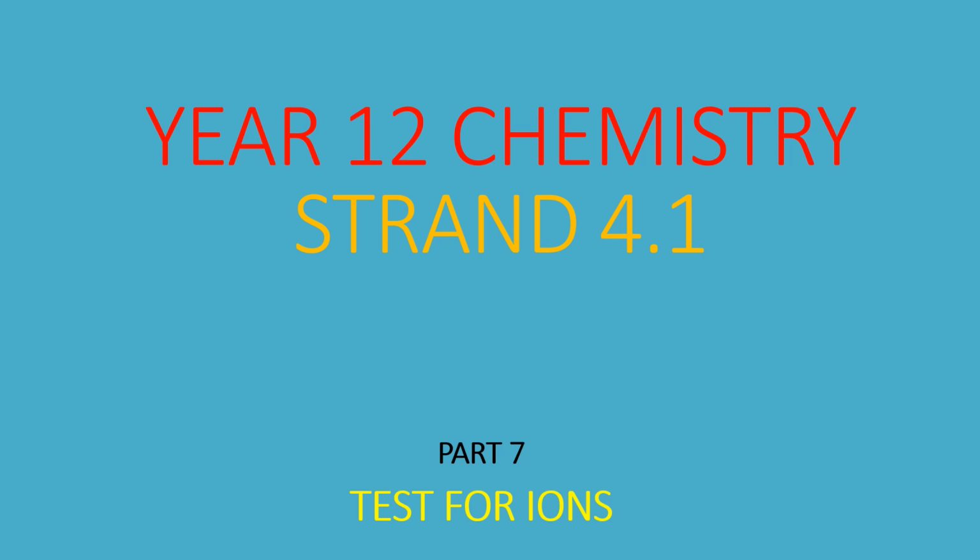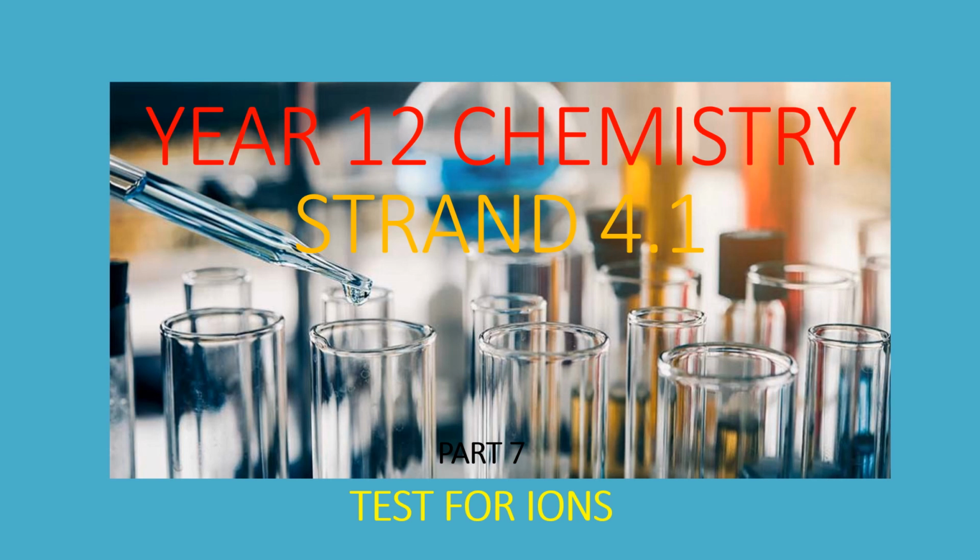Hello everyone and welcome to the last part of our topic on Strand 4.1. Please do watch this video until the end so that you are able to understand everything that I'm going to explain in this video, which also involves our practical component on test for ions. So we are going to see how we can do analytical chemistry, and at the same time we are able to identify the unknown ions which may be present in the solution.